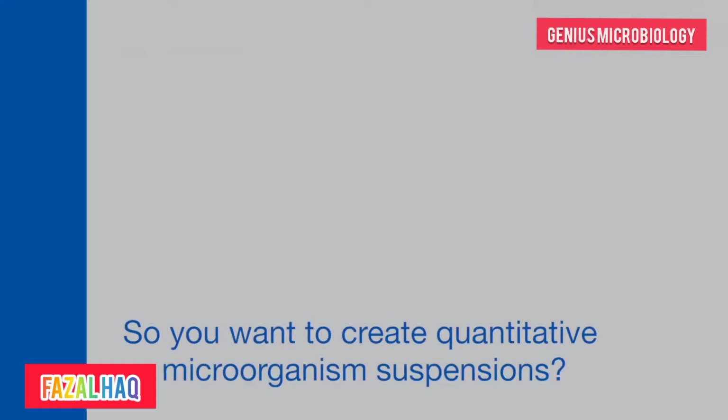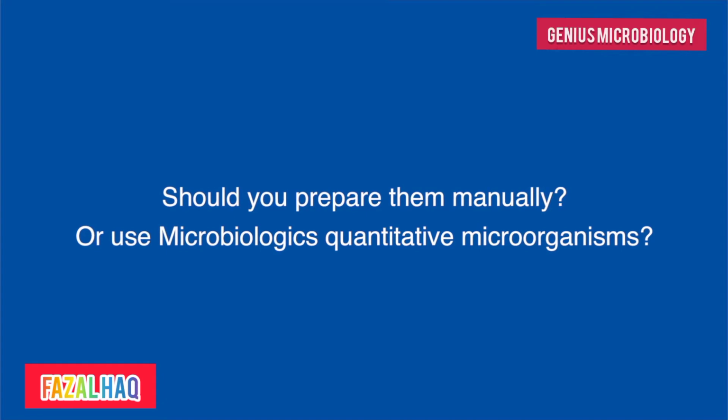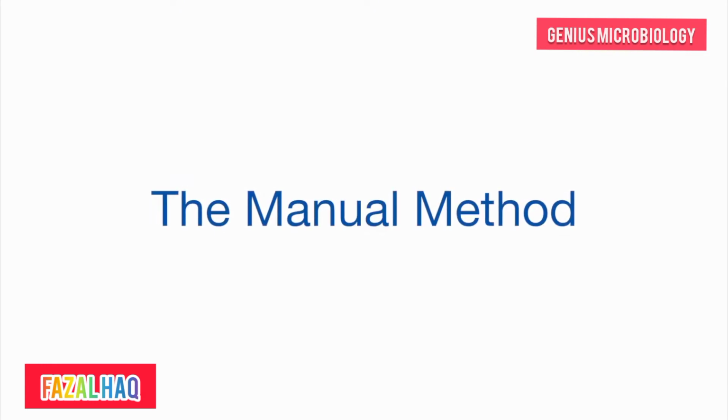Organism suspensions? Should you prepare them manually or use Microbiologics' quantitative microorganisms? Let's take a look at both. First, let's manually create quantitative suspensions.